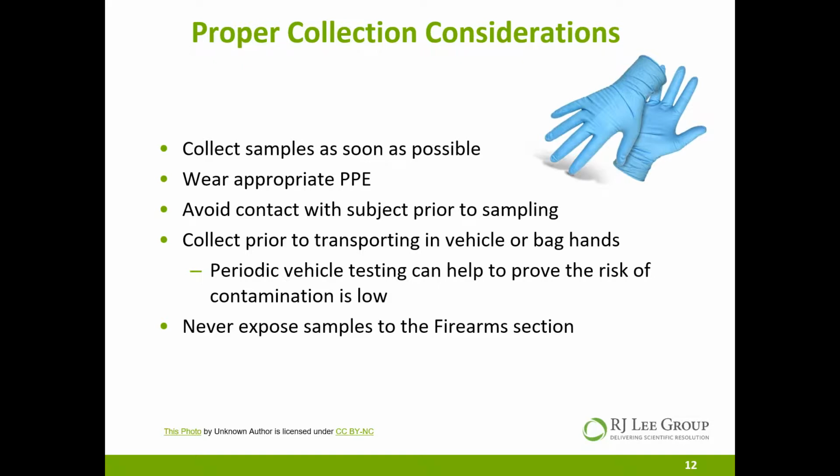While it's possible for gunshot residue to be transferred from a police officer to a subject, studies have shown that very few police officers have particles on their hands, basically because they clean their hands more often than they touch their weapons. So you're washing your hands more often than you're actually having the potential of getting primer residue on you. Now, it still is a possibility, but having that PPE, those latex gloves on is really going to give you that extra layer of protection.